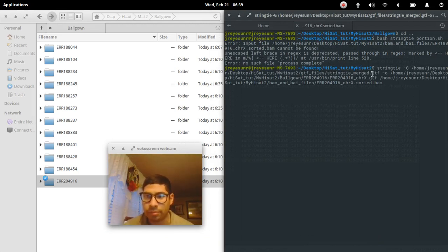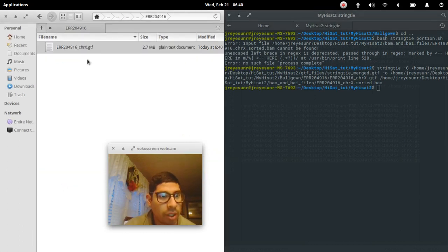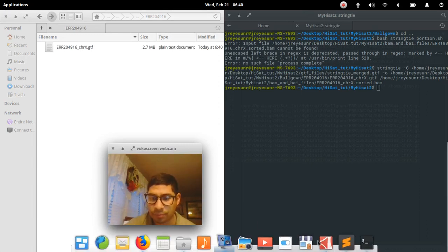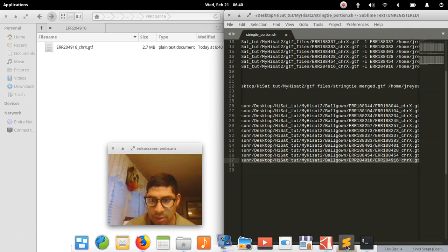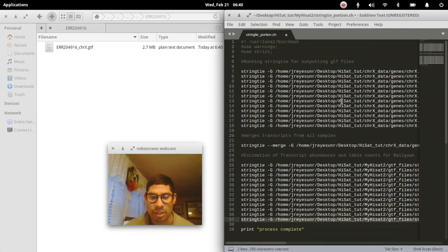And hopefully it works this time, because I did get the name right. 204916. Now let's check it out. And we got our file. So that worked. Thank you very much, and we'll be seeing the next section next time.